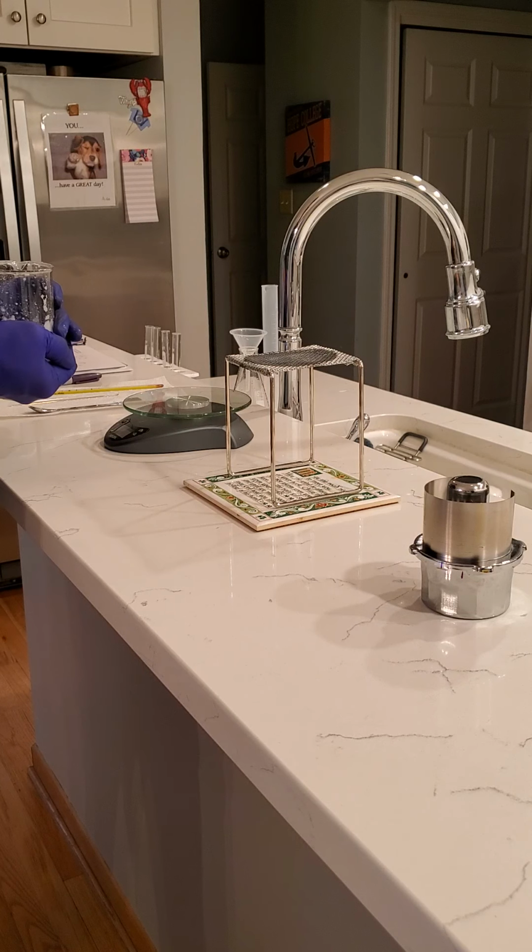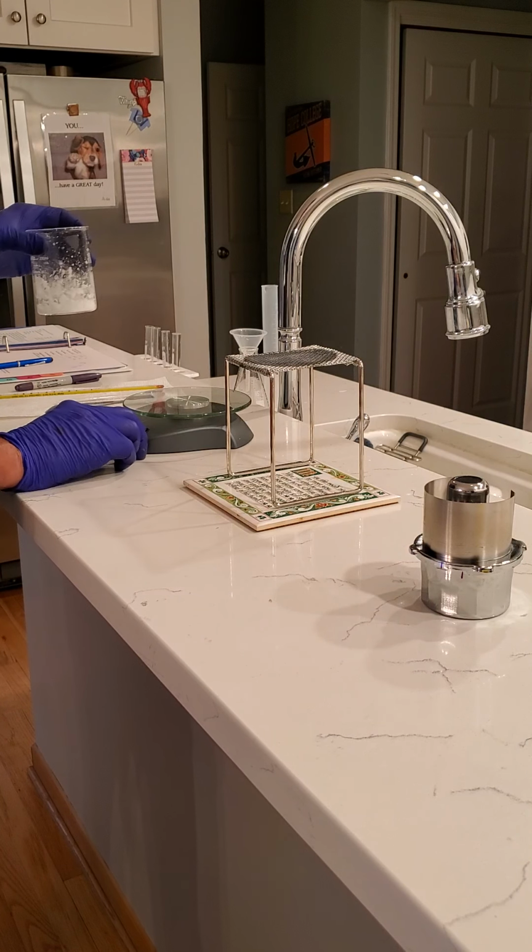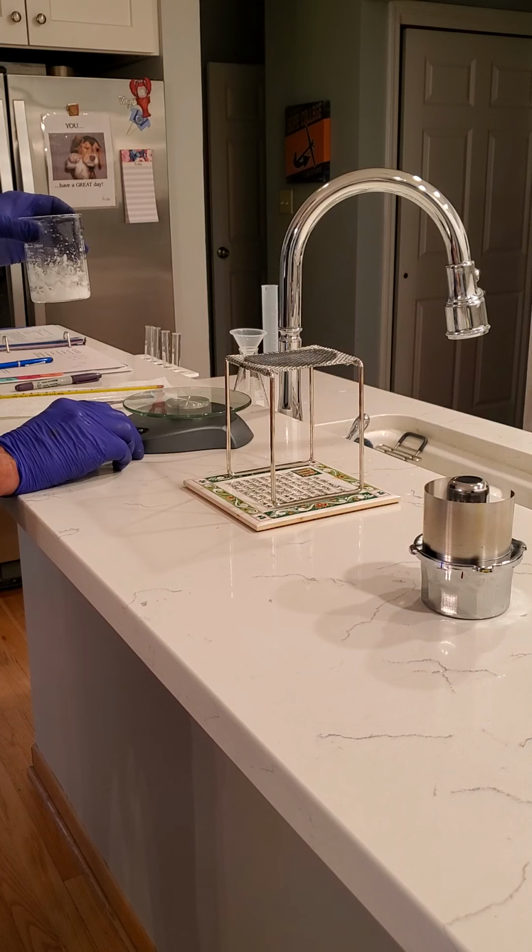It's cool now, and it looks fairly dry. We can compare our number to the theoretical value for the solubility of salt in water. Maybe we'll measure it twice. I'm going to get the final weight twice after we've let it dry out, maybe overnight. So we'll see. Okay, let's get our final weight here.